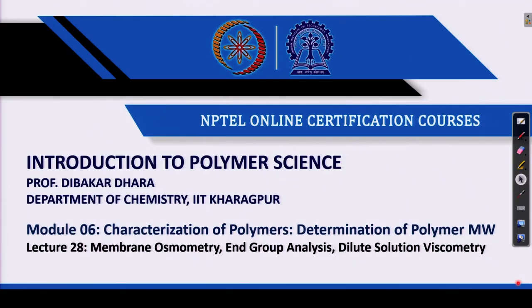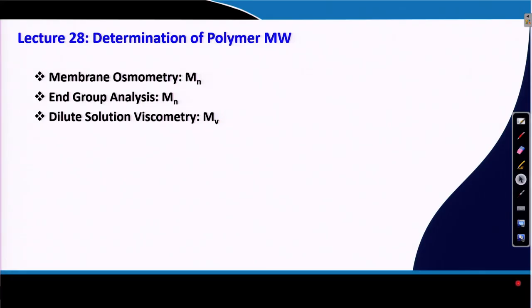Welcome back. In this lecture onwards, I will start a new module on characterization of polymers, specifically about determination of polymer molecular weight. And in this particular lecture, I plan to cover membrane osmometry, end-group analysis and dilute solution viscometry.